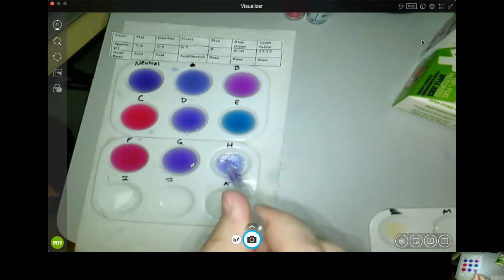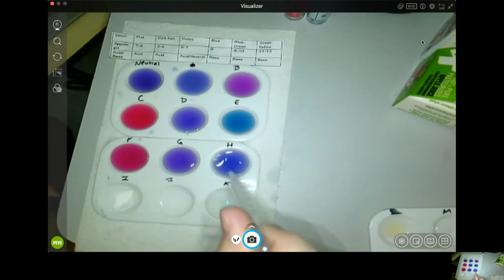H is the dishwashing soap, like for the dishwasher. I don't know if you can tell, it's a slight difference. It's a blue. Yeah, it looks a little different. It's right around where you would put the milk, so around the 8 range. So dishwasher soap is right around the H range, and it's going to be right around the 8 range.